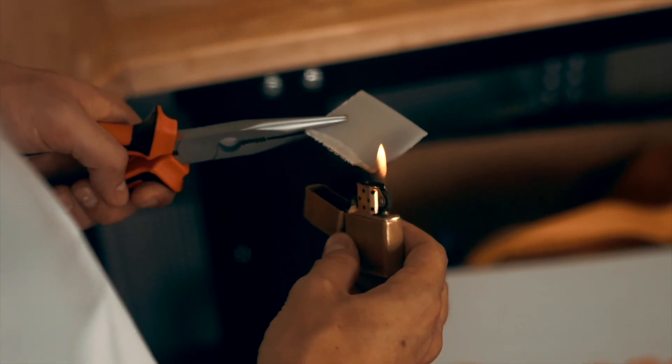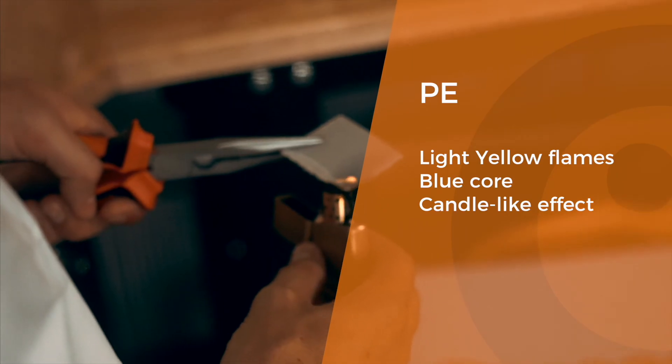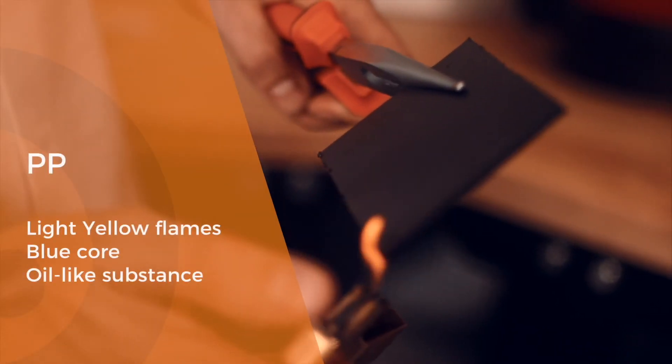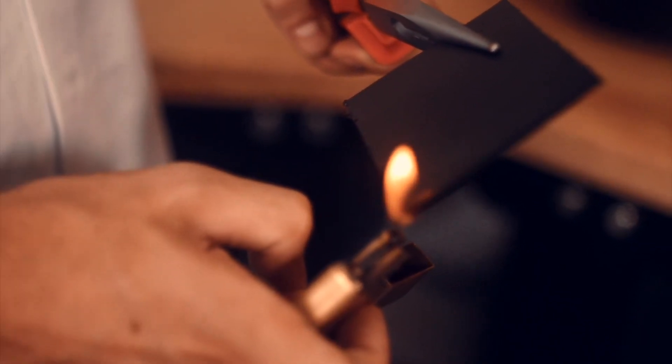PE results in light yellow flames with a blue core. The plastic will show a candle-like grease effect. PP results in the same yellow flame and blue core but the plastic itself will turn into an oil-like substance.